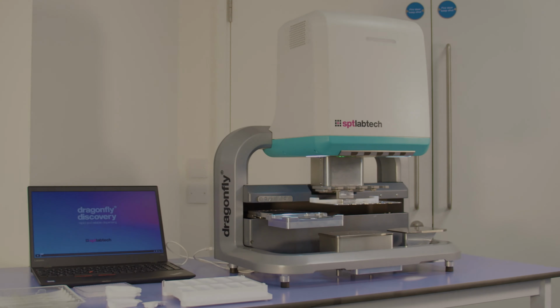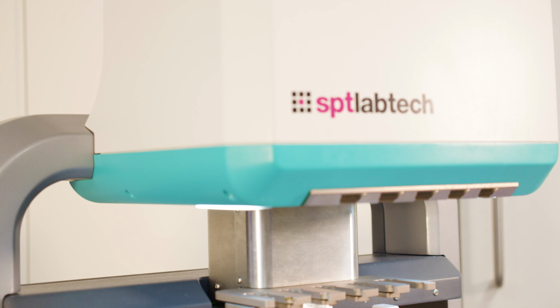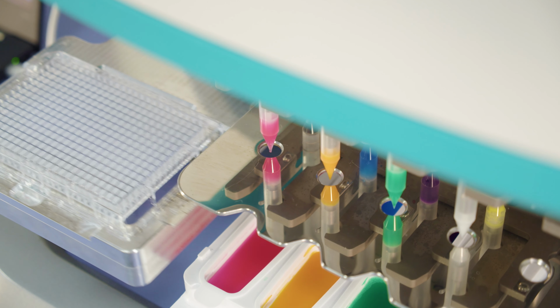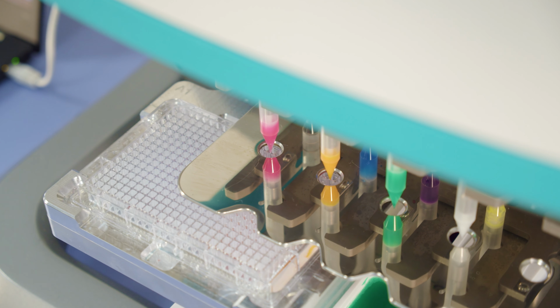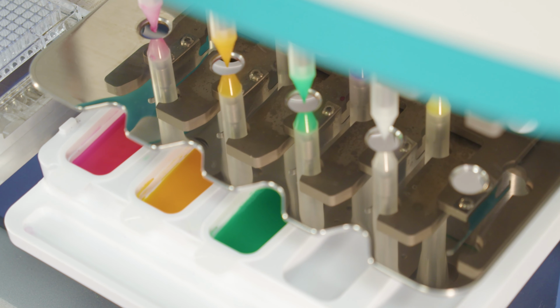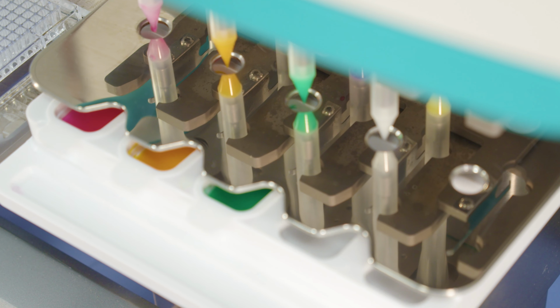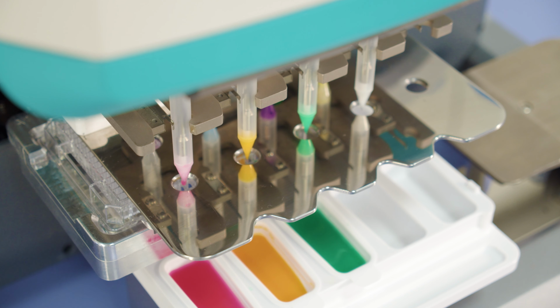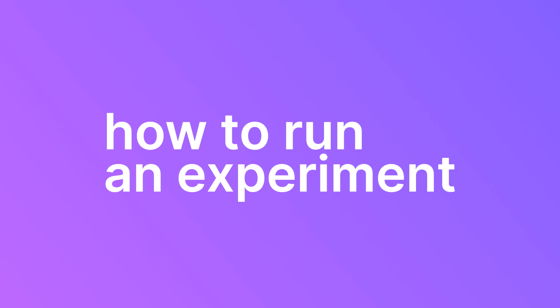The SPT Labtech Dragonfly is a small footprint, precise and rapid liquid dispenser, and it's often used for assay development, genomics, and design of experiments protocols. The Dragonfly uses positive displacement syringes to aspirate liquid from reservoirs and eject liquid onto your plate. So here's how to run an experiment on a Dragonfly using Synthace.